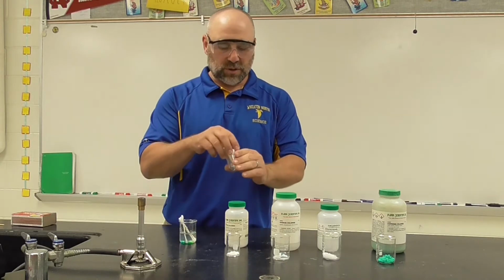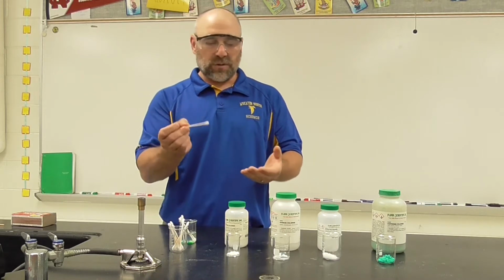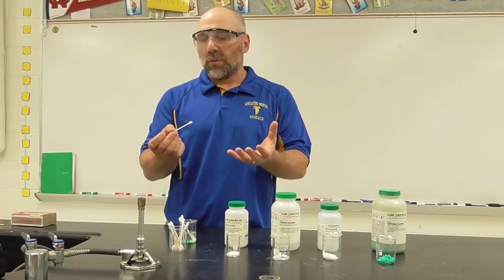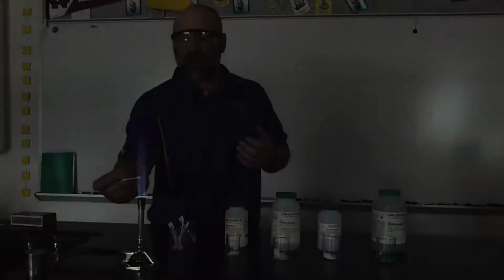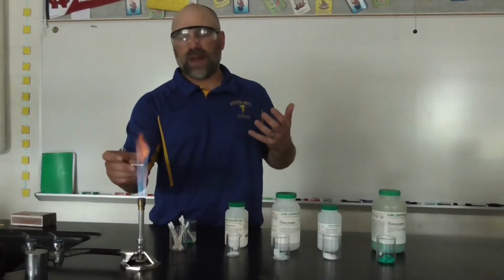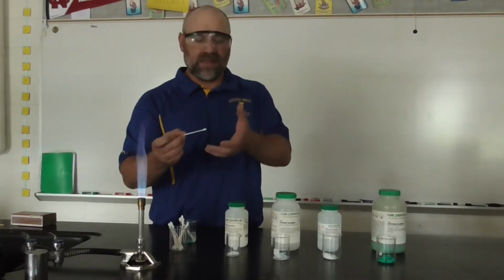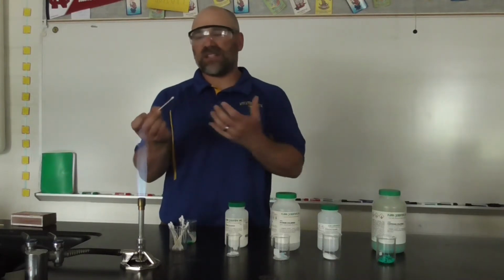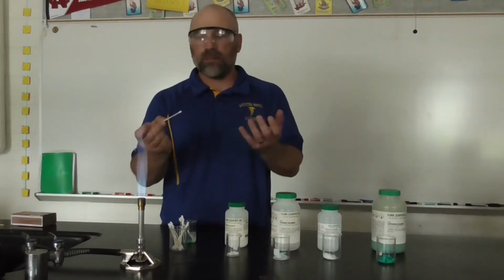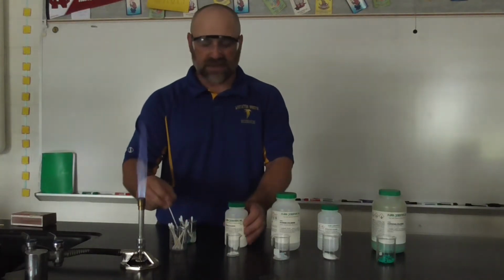So what I have here are some Q-tips. These Q-tips have been moistened for two reasons. Number one, so that when I place them into the different salts, the salt will stick to it. And number two, which I can demonstrate for you now, is to show that when they're wet, they don't light on fire. Now if I leave it in here long enough, eventually it's going to turn black and start to burn. But right now, all that's happening is the water's being heated, and when all the water's heated off, then this will eventually start to burn. The point of that is just to show that the Q-tip is kind of a control. It's a method for getting the salts into the flame, but you're not seeing a burning Q-tip throughout this lab.